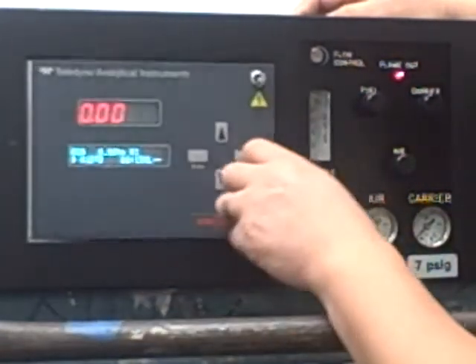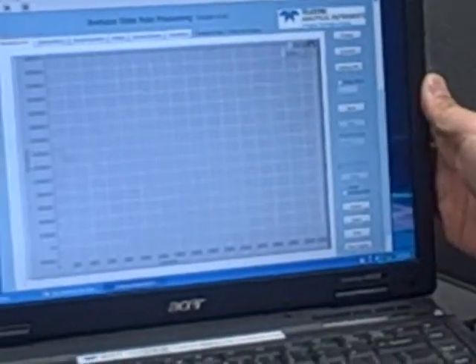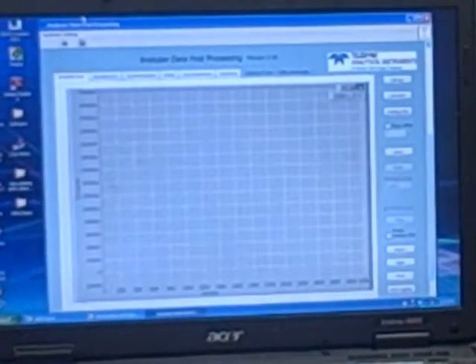have. Okay. Now, before you can run the GC operation, software operation, you need to have a laptop computer already installed with our GC software and a cable, USB to RS232 cable or RS232 cable to a serial port in the computer.